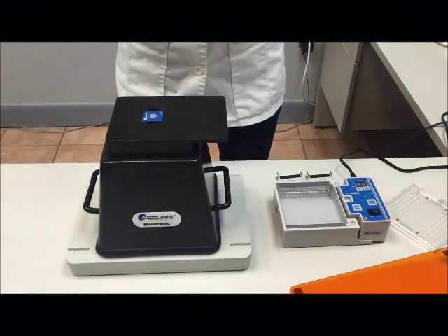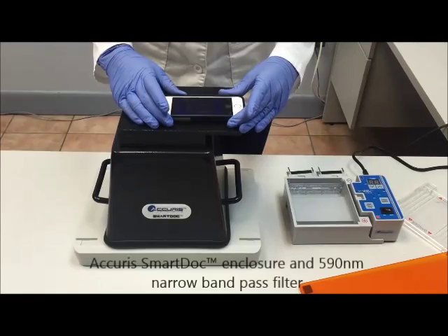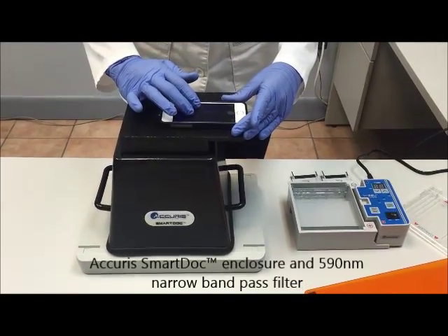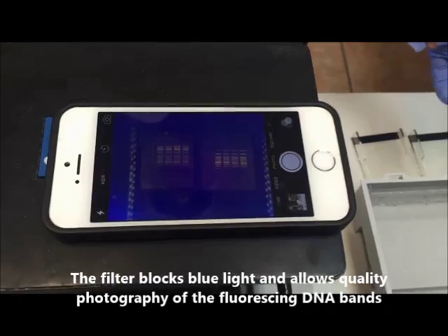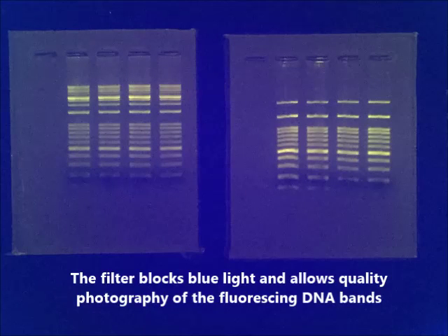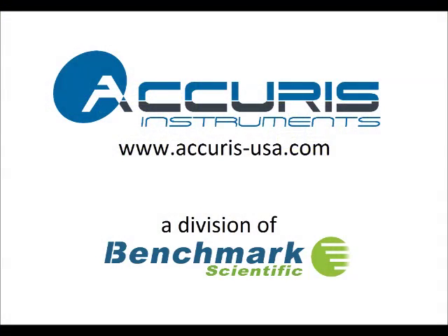Our final step is to document our results by taking pictures of the gels. We're using the Acuras SmartDoc Imaging Enclosure and a 590 nanometer narrow band-pass filter. This special filter blocks the blue light and allows high-quality photography of the fluorescing DNA bands using an iPhone or other smartphone with a camera. For more information, please visit our website at acuras-usa.com.